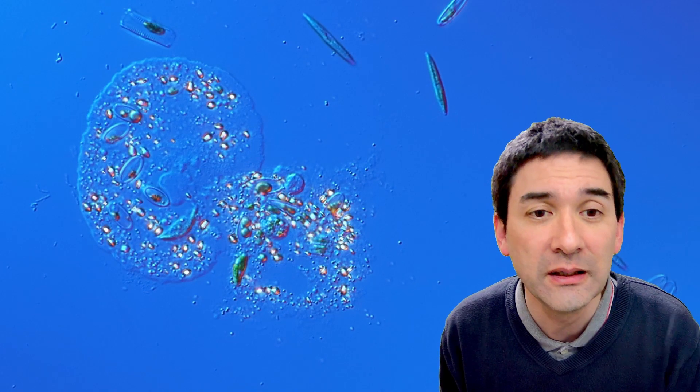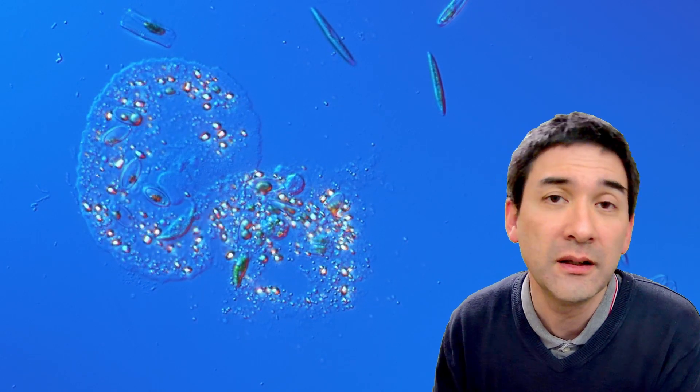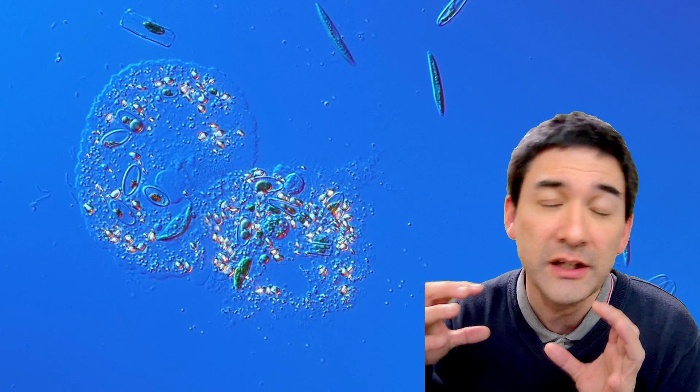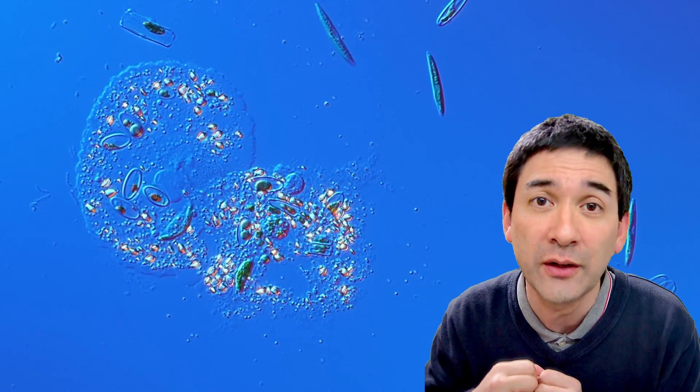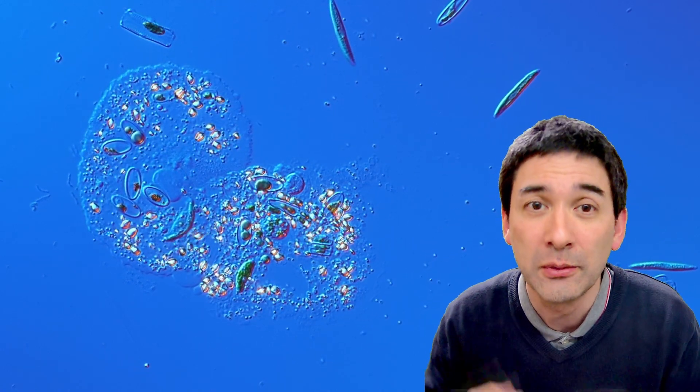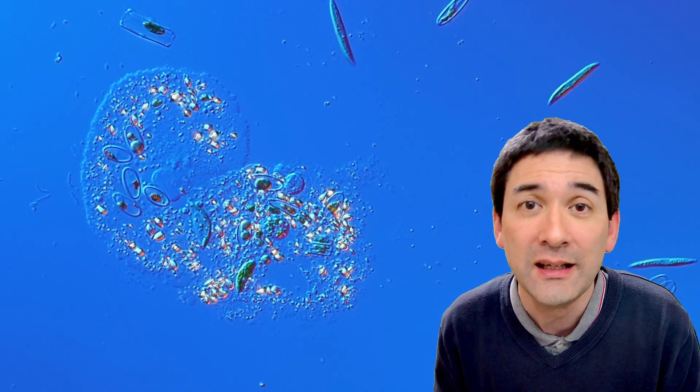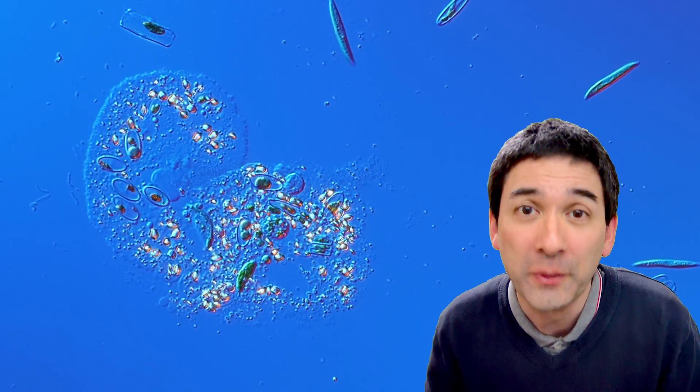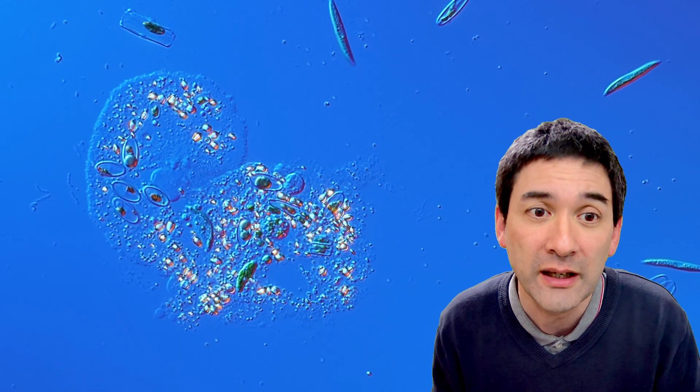So let's continue to watch this a little bit. The amoeba itself has a membrane just like all cells, they have a cell membrane around it. And when the pressure is too high, then the cell membrane is not able to hold the cell together again, and then it pops open and all of the contents are spilled out like you see over here.